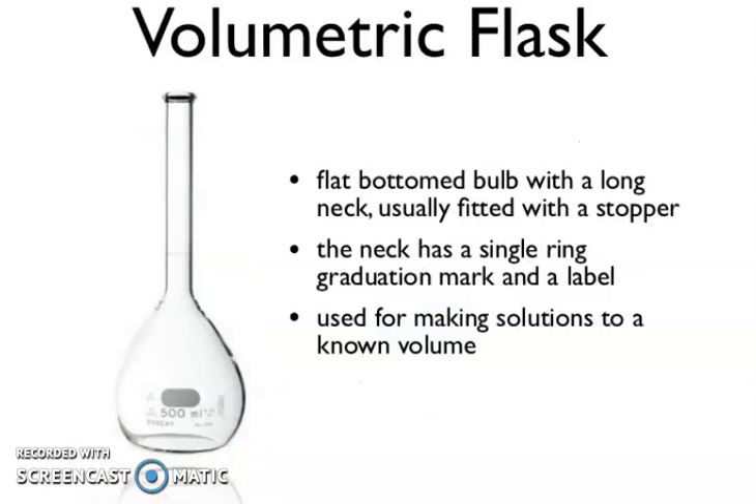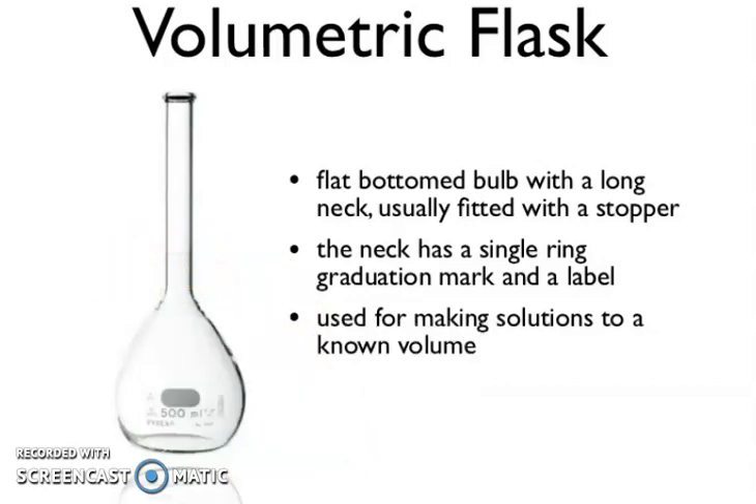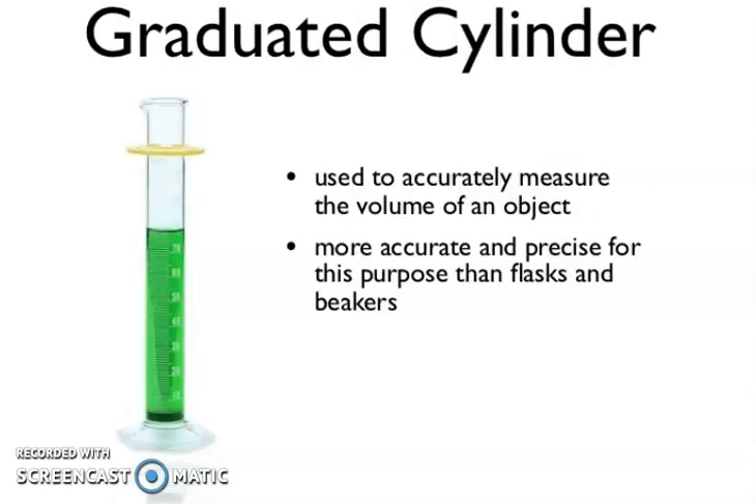Now, volumetric flask. It has a flat-bottomed bulb with a long neck, usually fitted with a stopper. The neck has a single ring graduation mark and a label — you can see the label says 500 milliliter and here you can see the mark. Used for making a solution to a known volume. A graduated cylinder is used to accurately measure the volume of a liquid, more accurate and precise for this purpose than a flask and beaker.